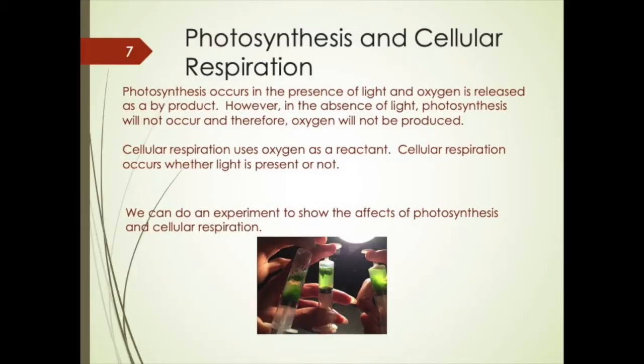Next, we're going to go to the next experiment. So this is the disc experiment. Photosynthesis occurs in the presence of sunlight or light and water. However, in the absence of light, photosynthesis will not occur and oxygen will not be produced. Right?